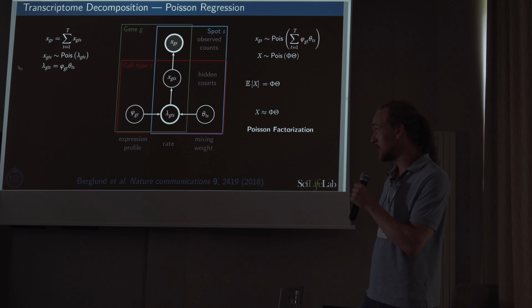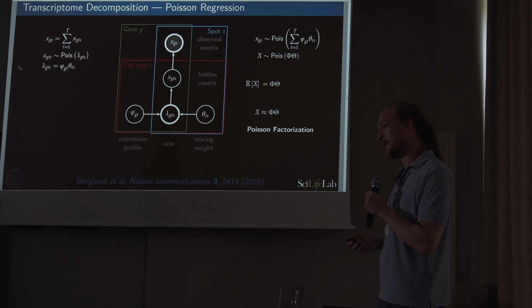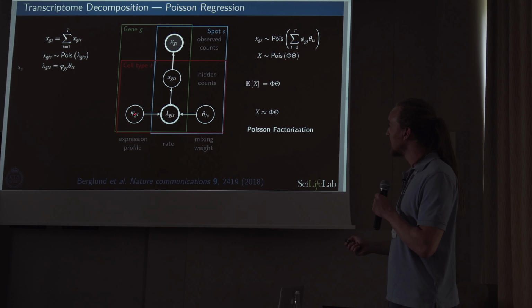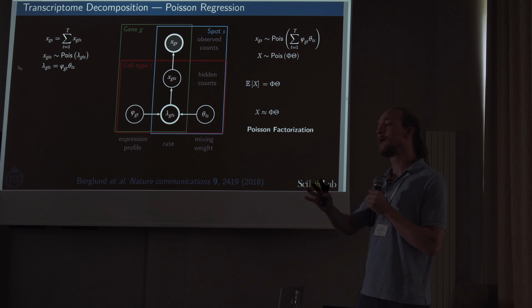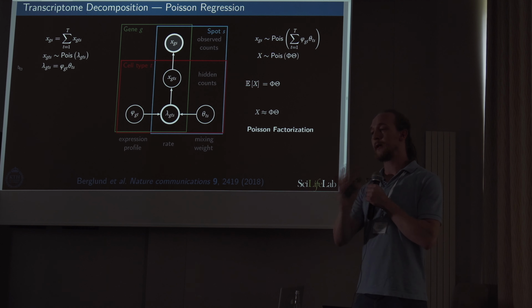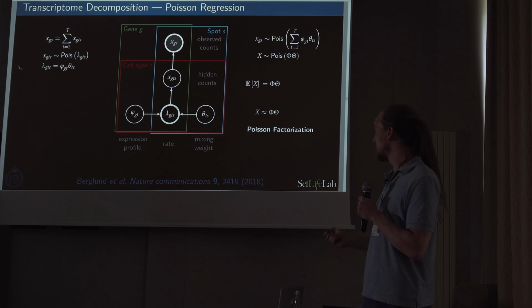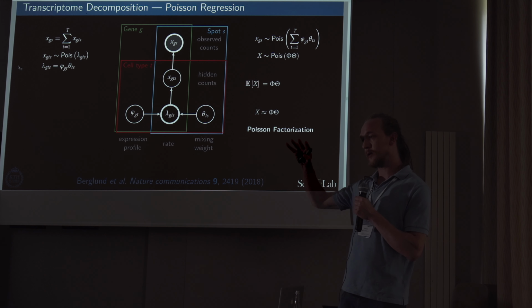Yeah, I mean, really I was brushing over a little bit of the details. So while I write it here as a product of two matrices, you can also multiply in vectors for the spots, for example, or for the genes. So in this way, you would have spot scaling factors, which would address entire rows, columns in this matrix here, so as to downregulate all of the genes expression in that spot.